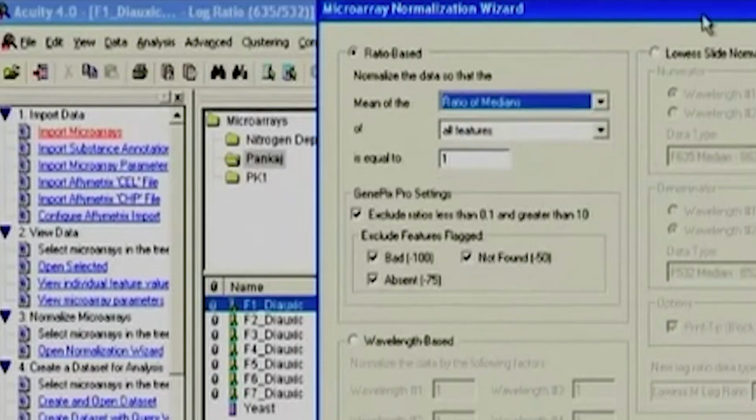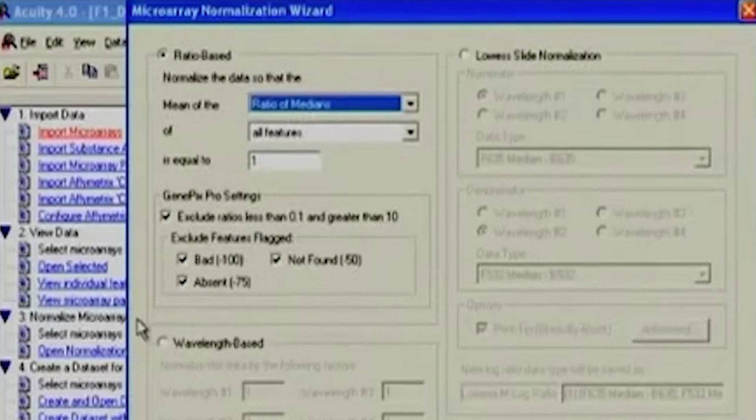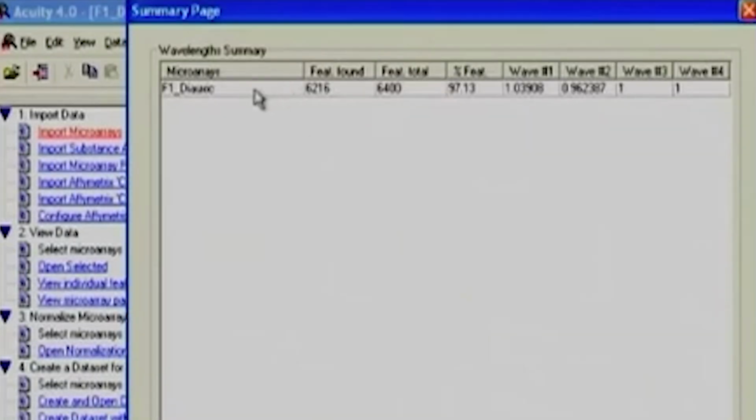And if you see, in the next button, with all the flagging, if they are flagged, please don't allow them for the calculations. Okay. Then you just click next. It shows that it is available and being done, and I can say finish, which means I have finished my normalization. If you carefully look back, the spot, the purplish one, will change to red, which lets one understand that all my images are now normalized in a similar fashion.